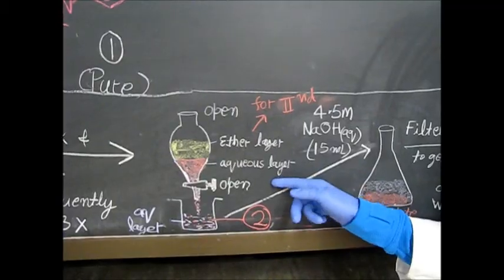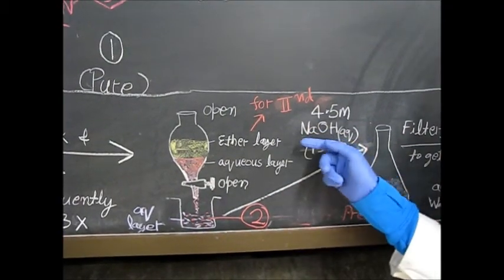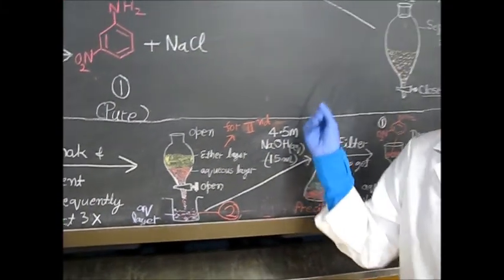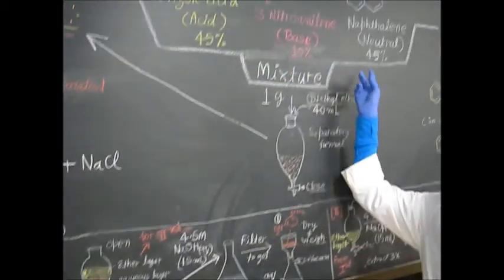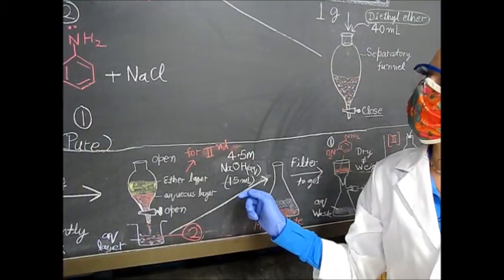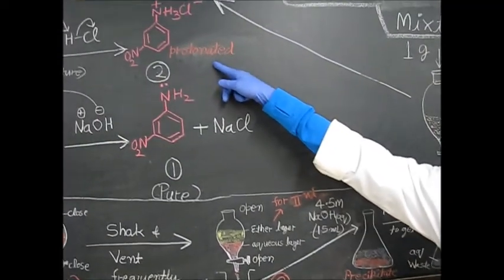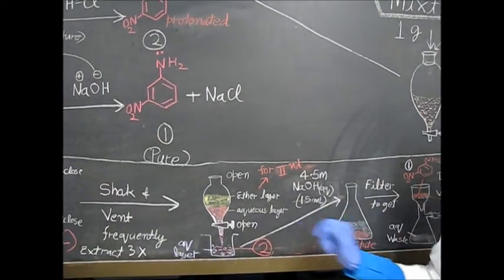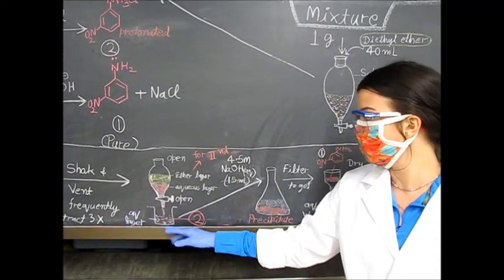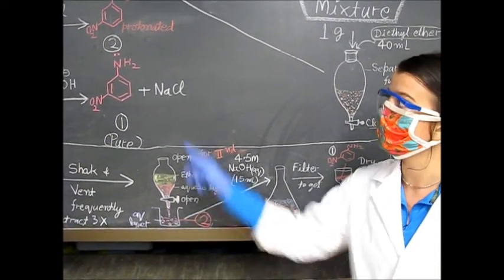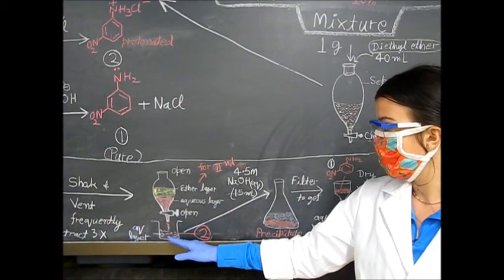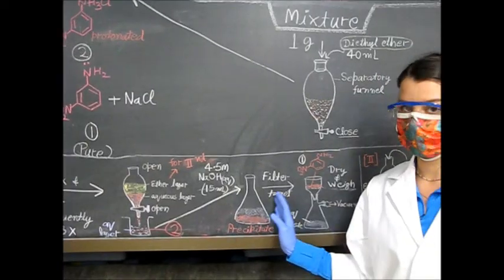In the separatory funnel, there are two different layers. The top layer is going to be our ether layer, which contains the benzoic acid and naphthalene. The bottom aqueous layer is going to contain our protonated nitroaniline. Once we separate the bottom layer out — which contains the protonated form — we will save that and perform experiments on it afterward.